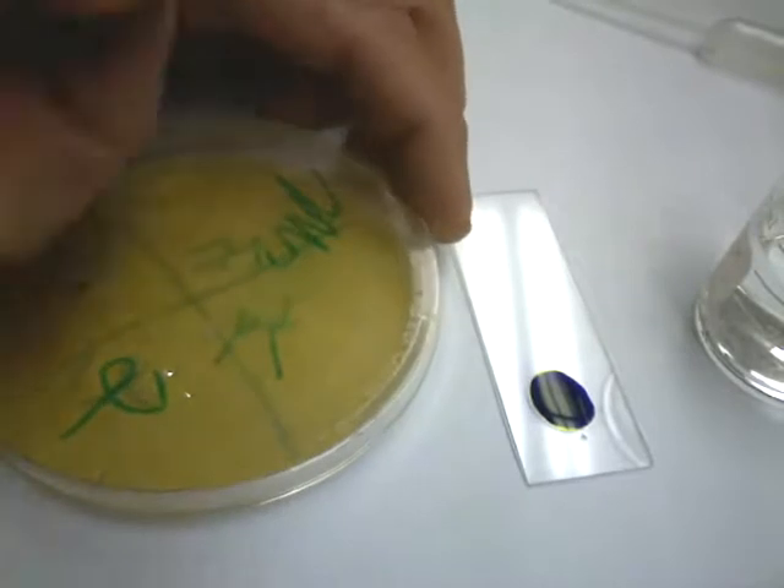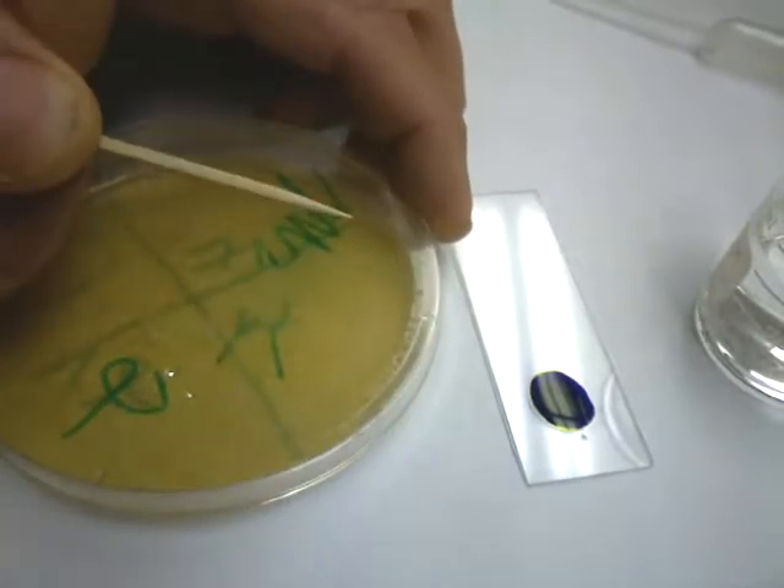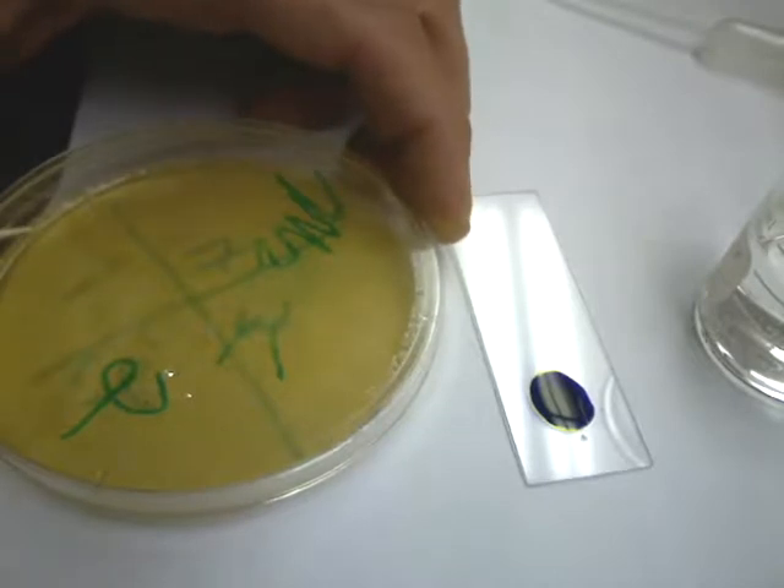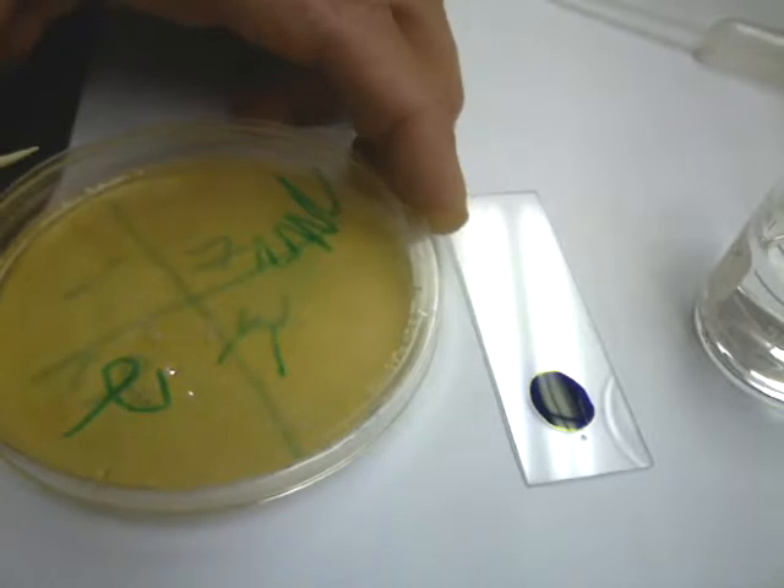In order to start this, we're going to use toothpicks to apply this. We want to make sure we don't get any of this on us. If we do, we want to use hand sanitizer, and absolutely do not get it in your mouth. It shouldn't be a threat to you, but we don't want to take any chances.